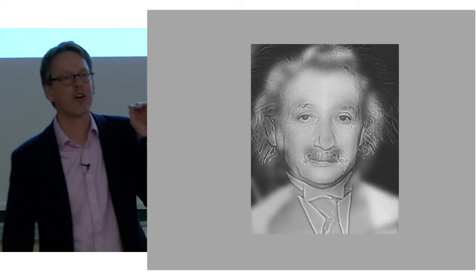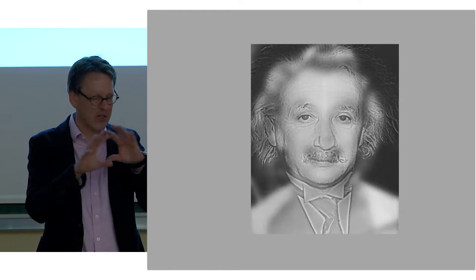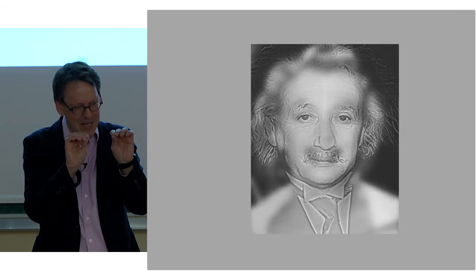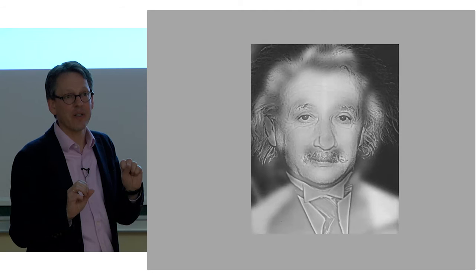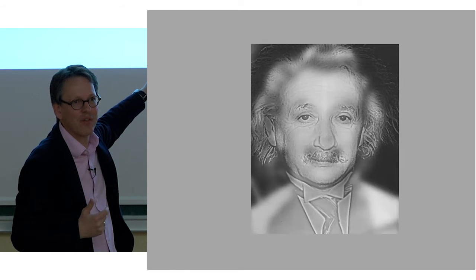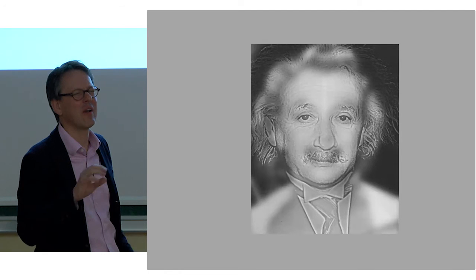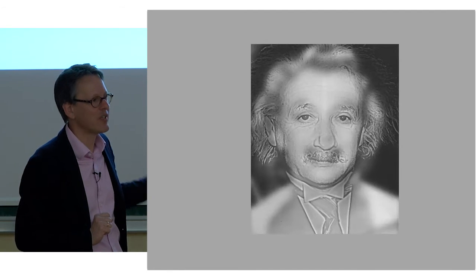So close your eyes almost completely and squint at this image. Just close them completely so you see nothing, and then open them so you just see a little tiny bit of light coming through. You really have to close them almost completely, and then look at this image, and you will see, once you blur or take your glasses off if you have them, squint completely. I mean, really, you have to get a completely blurred image from this. And you will see Marilyn Monroe.